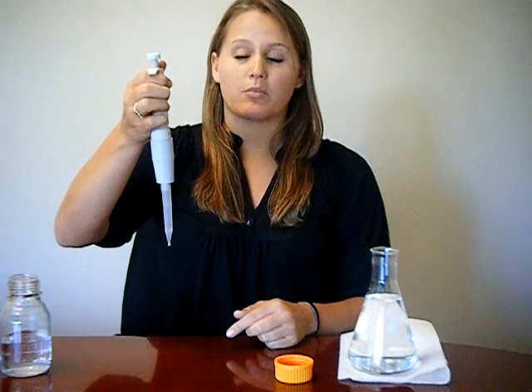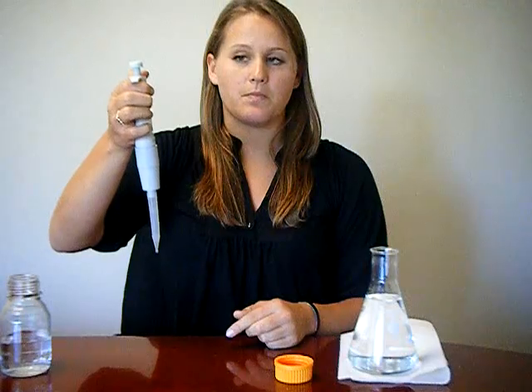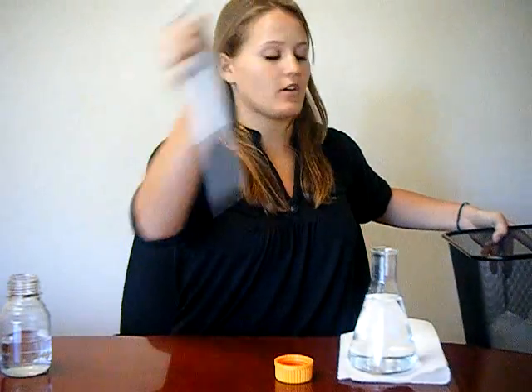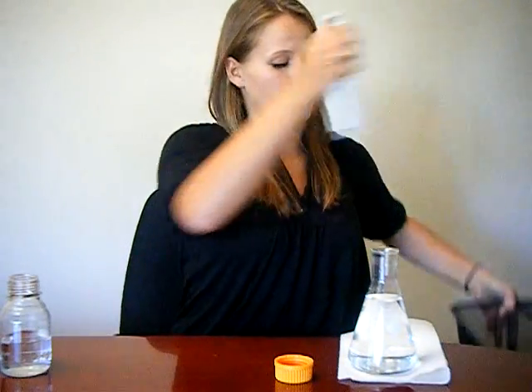When you are done with the process and no longer need the tip, hover the micropipet over a waste bin and press firmly on the ejector button next to the plunger. You are then able to put on another tip and continue the process.